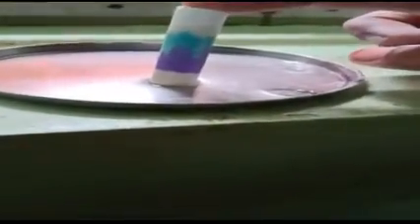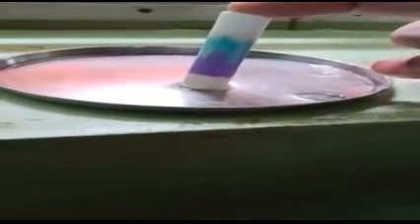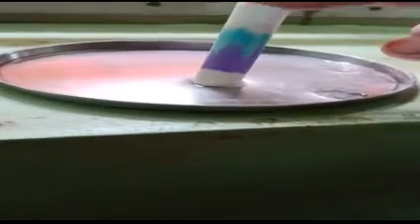Like this, by using the chromatography method, we can separate the different colored liquids from a single color.